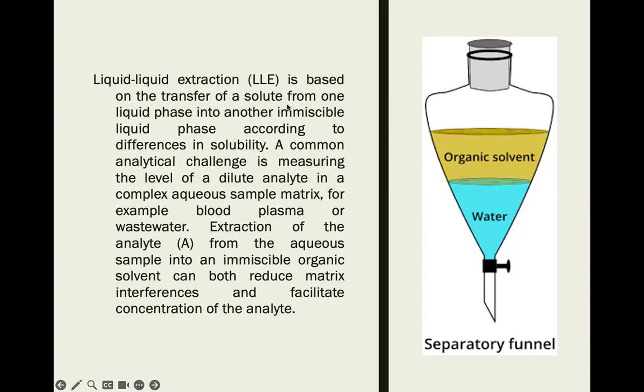So the transfer of solutes from the aqueous, the sample that you prepare, for example, from the coffee bean, is here, and you want to transfer the solutes that you wish to measure, for example, just now, caffeine, into organic solvent, from one liquid phase into another immiscible one. So what does it mean, immiscible? You can see here the solvent is divided into two phases. It does not mix. So it is supposed to be an immiscible liquid phase, according to differences in solubility.